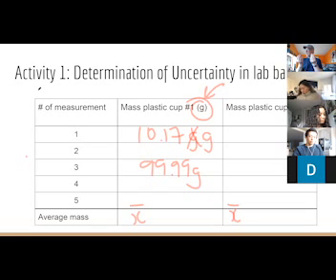So that's another reason why scientists generally, like when I worked in a biochemistry lab, I always wore gloves. And it wasn't because I was worried about the danger of what I was working with going into me. I was more worried about me going into my solutions. I didn't want enzymes coming off my hands and dissolving all of the stuff I've spent weeks making in the tube. So I was more worried about me becoming a problem with my solutions. So that's something else to consider. All right, so this one's fairly straightforward. Let's go to the next.